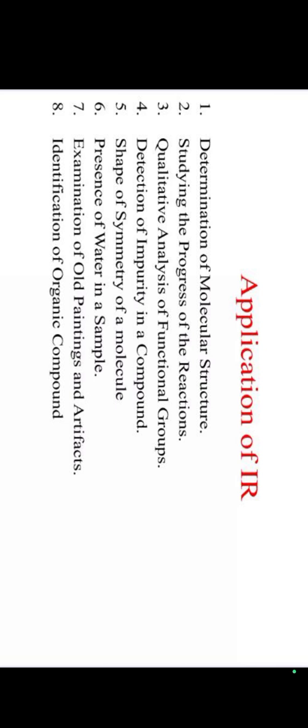Once again, revise the applications of the infrared radiation spectrophotometer. First one, determination of molecular structure. Second one, studying the progress of the reaction. Third one, qualitative analysis of functional groups. Fourth one, detection of impurity in a compound, shape of symmetry of the molecule, presence of water in a sample, examination of old paintings and artifacts, identification of organic compounds. These are the applications of the infrared spectrophotometer.